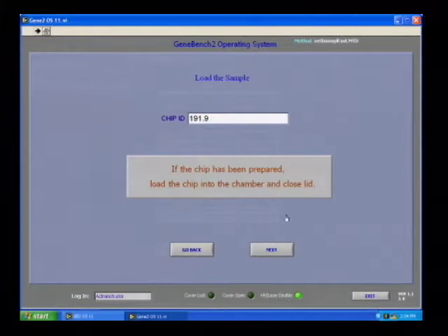The GeneBench software also allows you to connect to a LIMS system, which has tracking data for samples and batches. Before loading the chip into the chamber, the chip ID is entered and prepared, and we are now ready to move to the next step.